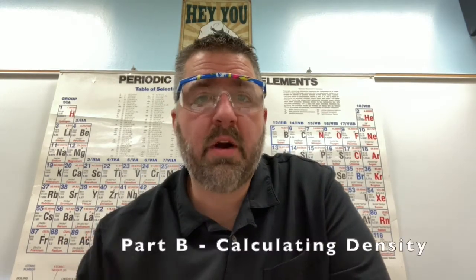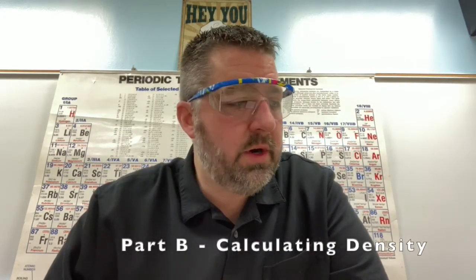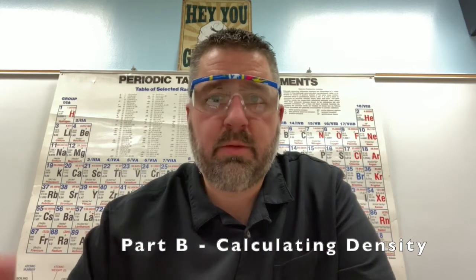Okay, so now for part B of the lab, we're going to take a certain liquid, we'll just pick one randomly, and we're going to try to get mass data and volume data for that liquid so that you at home can calculate the density of one of the liquids that we used. Okay, so let's go do that.